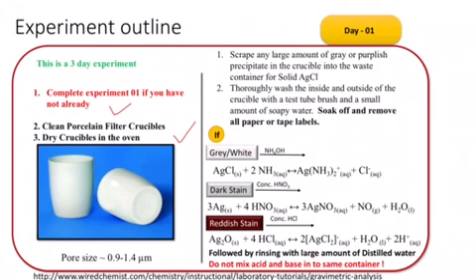When cleaning the crucibles, please make sure you do all the 3 cleaning steps mentioned in your lab manual. That means, first wash the crucibles with ammonium hydroxide, then with nitric acid, and finally with hydrochloric acid. Please make sure to dispose ammonium hydroxide left in the flask into the base waste container before starting washing the crucibles with acids.